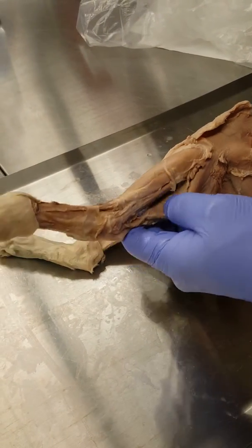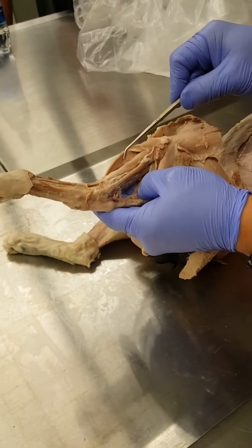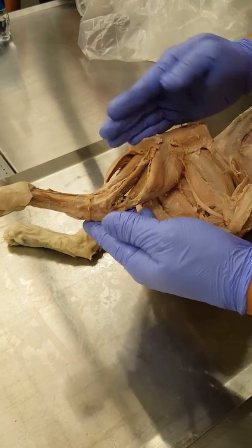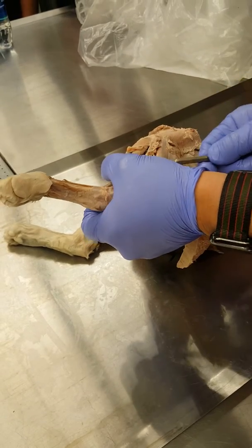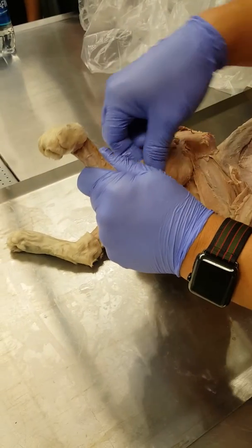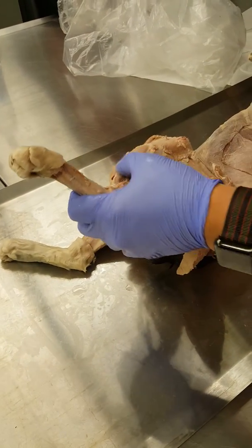So then if we're identifying them, the muscles that are here innervated by peroneal nerve, you can see the separation right here. See the separation right there? So this first muscle, this is the tibialis anterior. And then as we move laterally around, you get to the next muscle. This is the long digital extensor, extensor digitorum longus. And this is where we did that thing where we pull on the long digital extensor, and you see the digits extending, right? So that's long digital extensor, peroneal nerve.